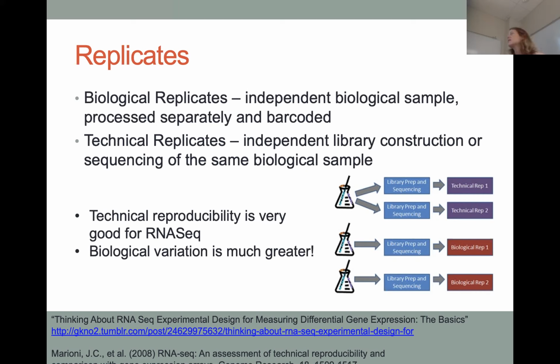So in the data set that we were just processing, we had 3 biological replicates. We had the exact same genotype of peach tree that had been grafted and made into 3 identical clonal trees. And we were taking bud samples from each of those trees independently to see what our biological variation was over the course of the winter between these 3 genetically identical trees.